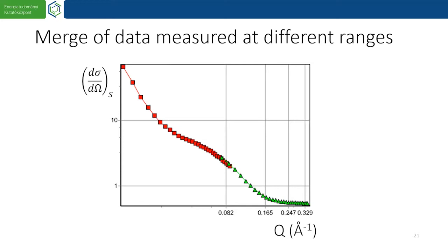So this is always in small angle scattering. We use this inverse angstrom or inverse nanometer, and in normal diffraction, in X-ray diffraction especially, people use angle, simple angle in degrees. Yes. Or sometimes, if you met it, they can also use the spacing, so they can use the inverse of the degrees. So they represent the data in lattice spacing. Okay.